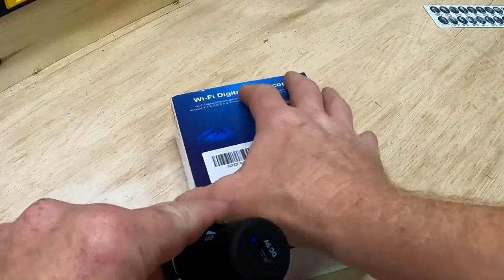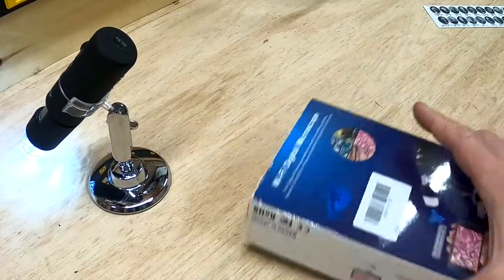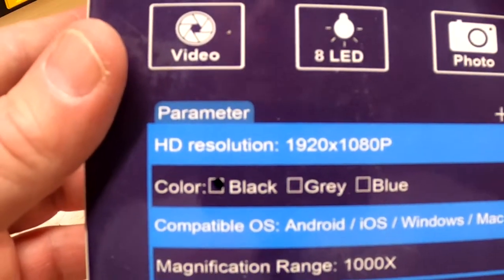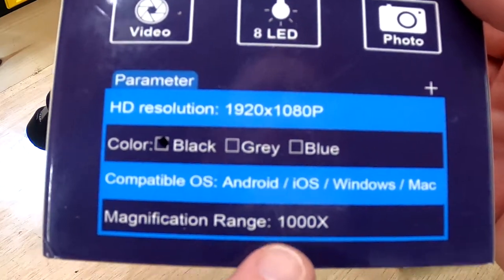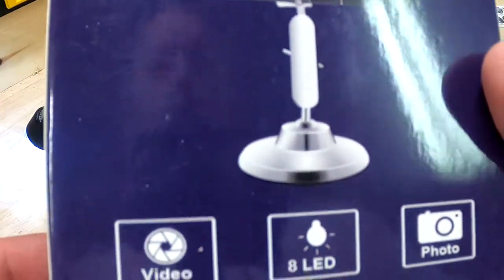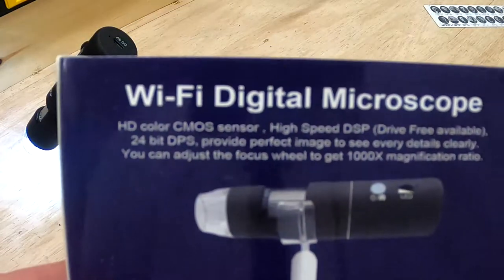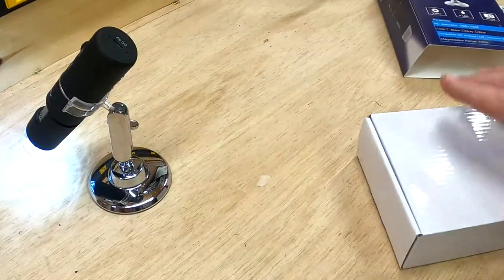You can use this with a computer, an iPad, or a phone. It's 1920 by 1080p and they say it's compatible with Android, iOS, Windows, and Mac — I've tested it and it is. They claim a 1000x magnification range, though like a lot of products on Amazon, especially those made in China, the specs aren't always exactly what they claim. It has a 24-bit sensor built in and it does a really good job.